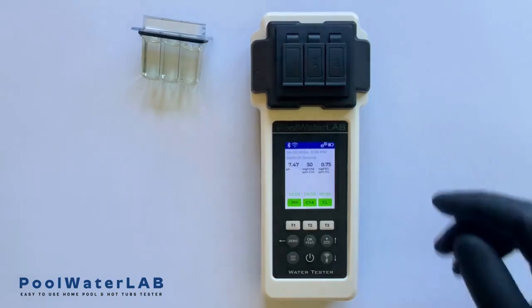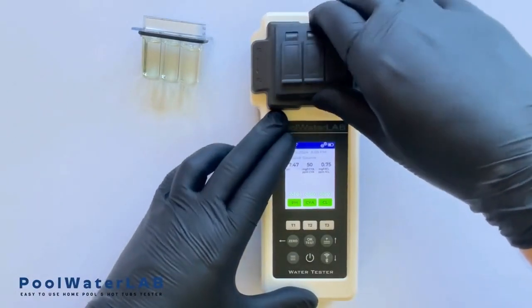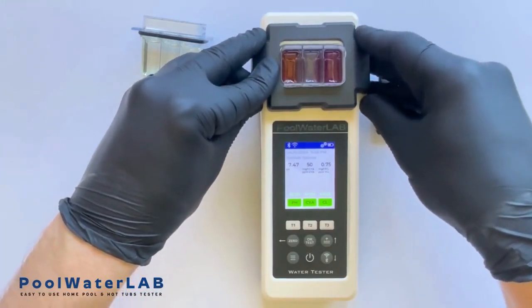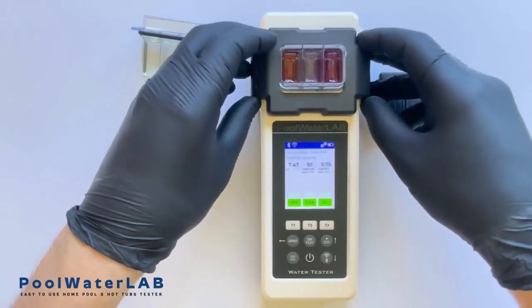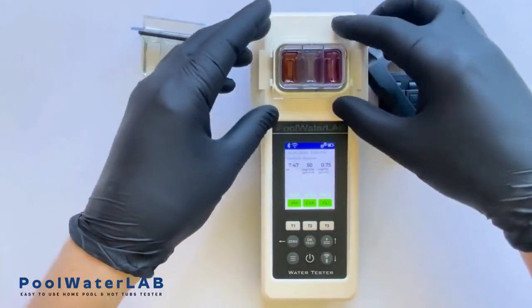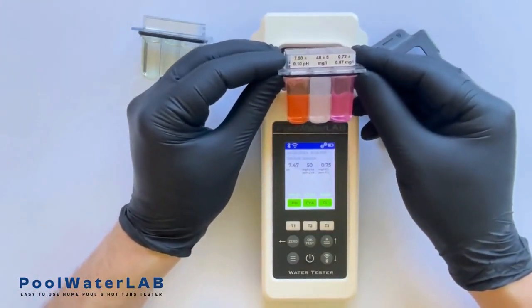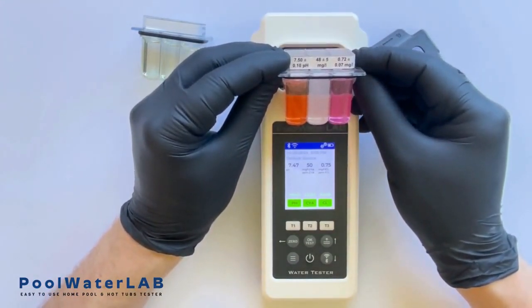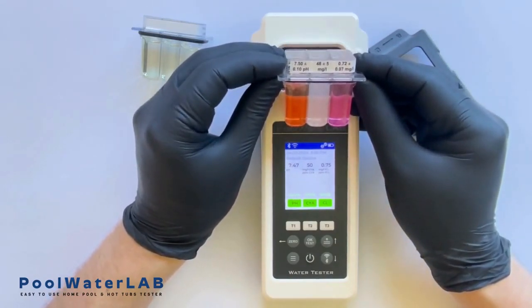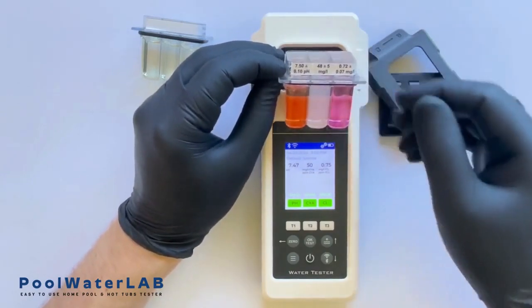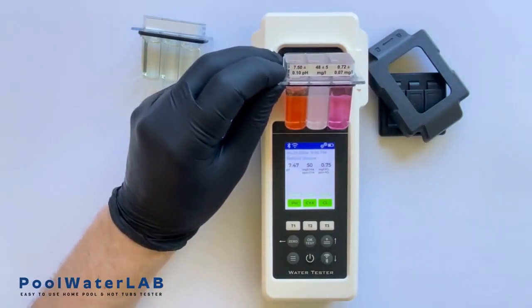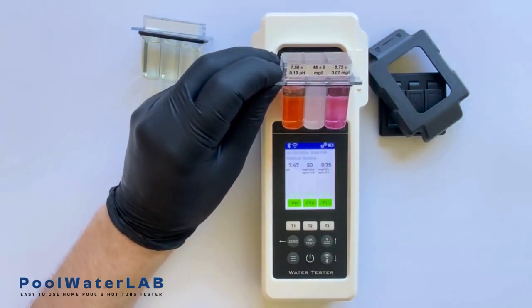Let's review the results and compare them with the laboratory samples. To do this, we need to retrieve a sample from the measurement chamber, where we can view all parameters as verified in the laboratory. The first parameter is pH. The laboratory sample indicates a value of 7.50, while our tester shows a value of 7.47. This minor variance is within the permitted range and is not considered significant.